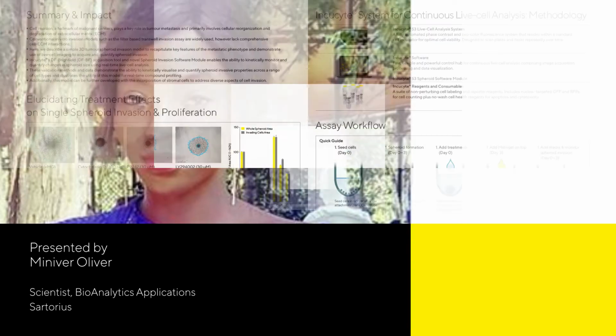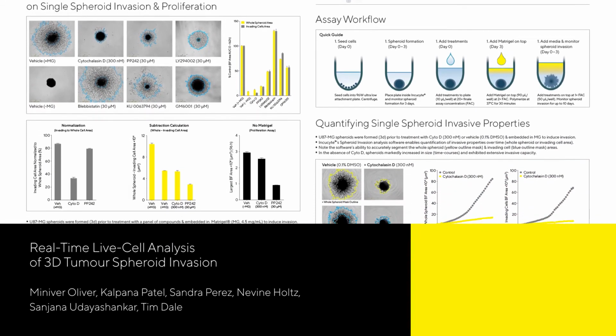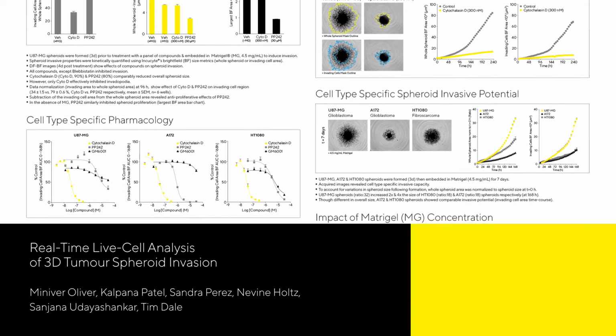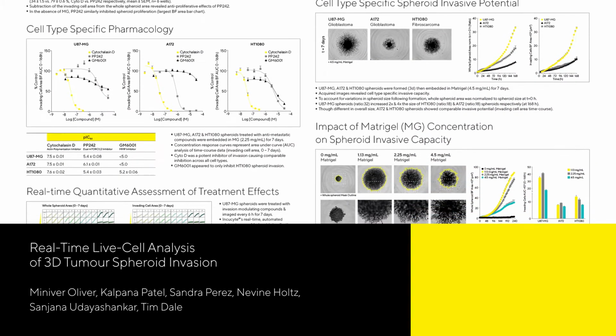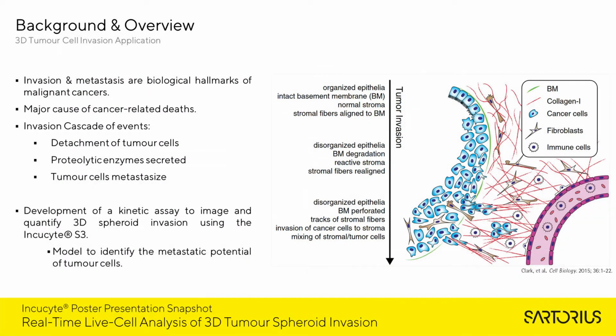I will be walking you through one of our posters presented last year at SLAS, and this poster is entitled Real-Time Live Cell Analysis of 3D Tumor Spheroid Invasion. Now, before I get into some of the assay setup and the data generated using this approach, I really wanted to give a brief overview or background on cell invasion.